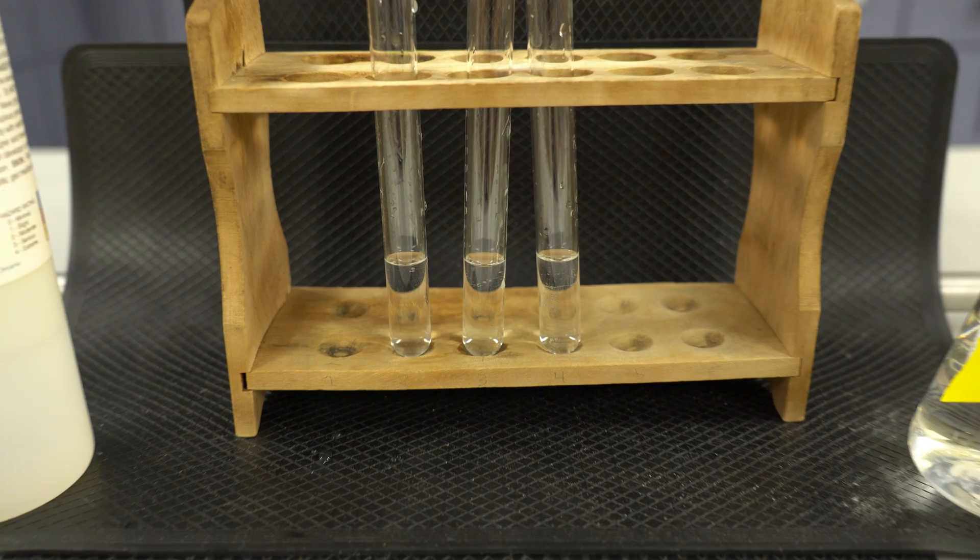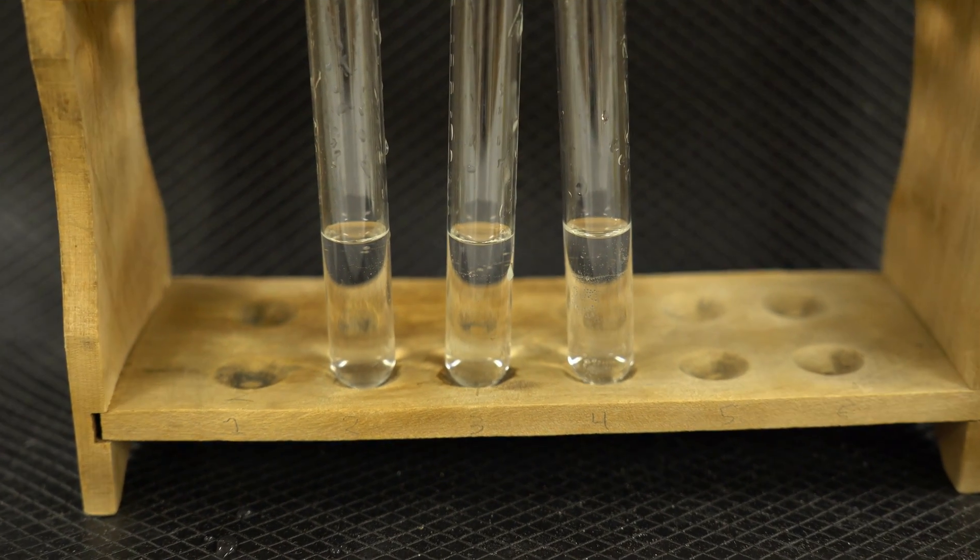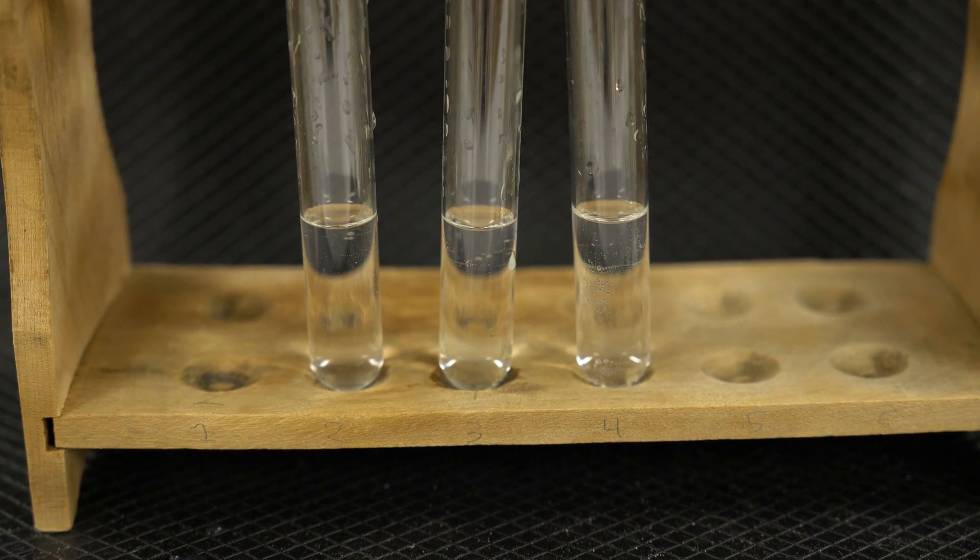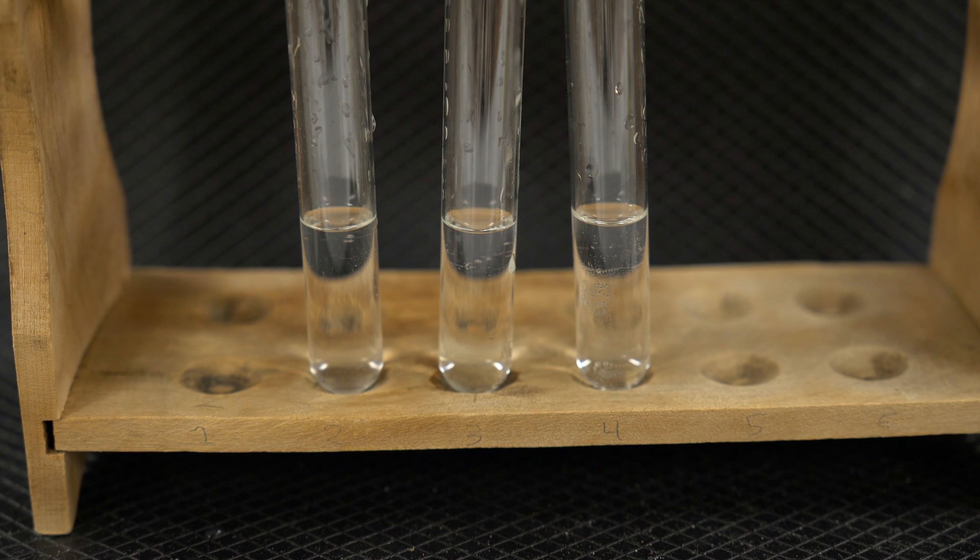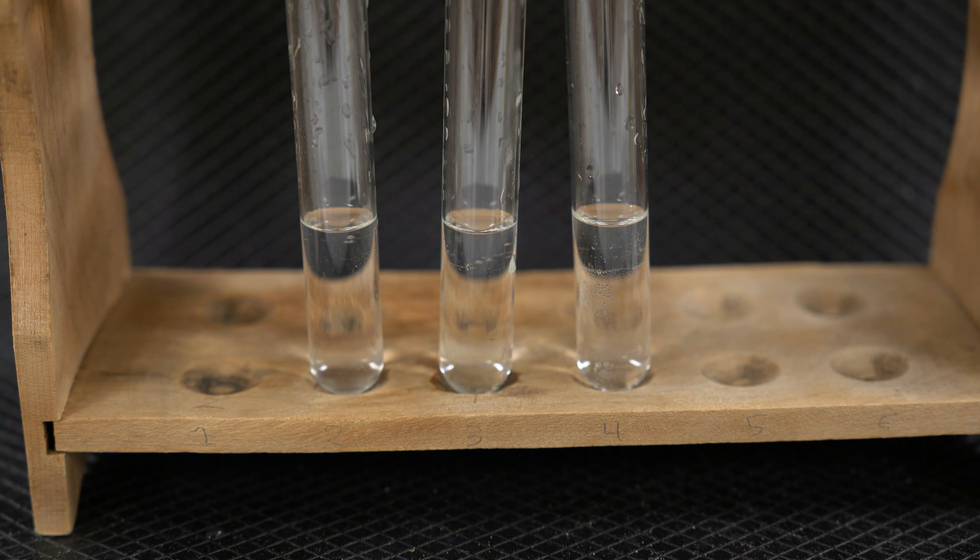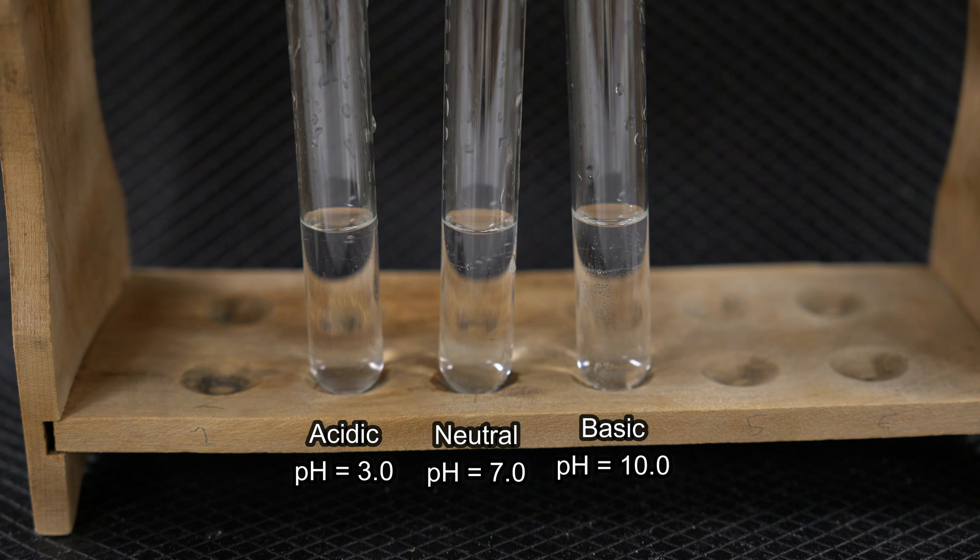So now I have prepared equal-sized potato pieces. We're going to add them to this hydrogen peroxide that has had its pH adjusted to either lower, normal, or higher, and see how they react.